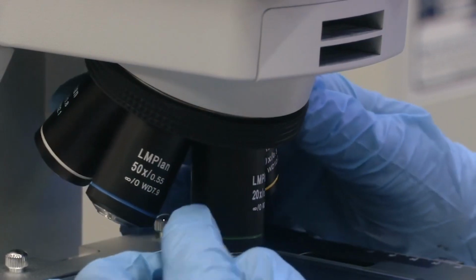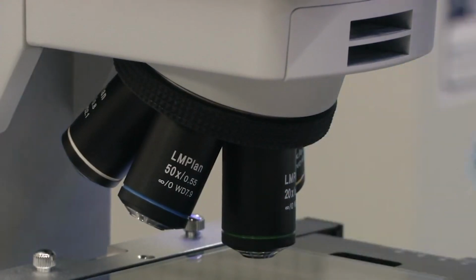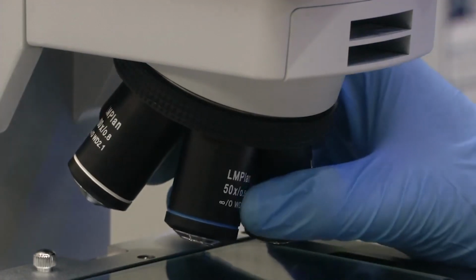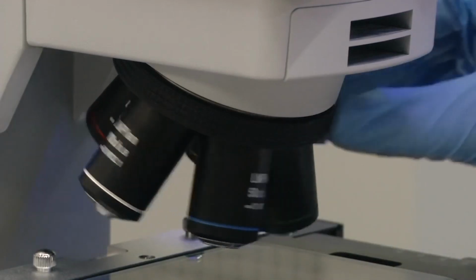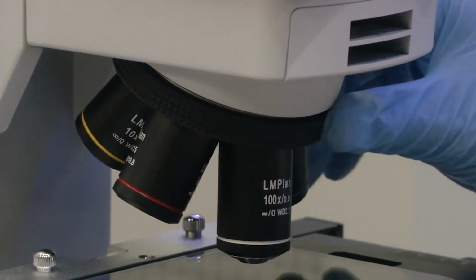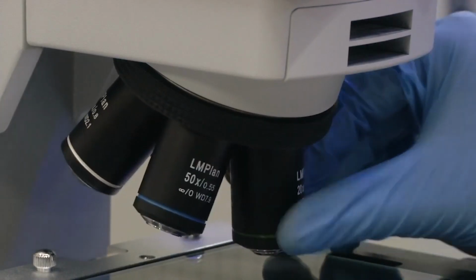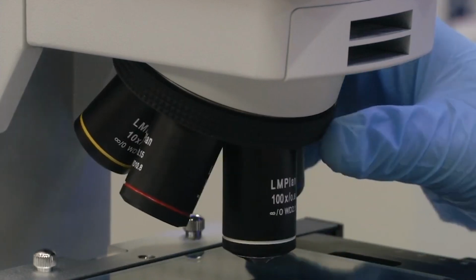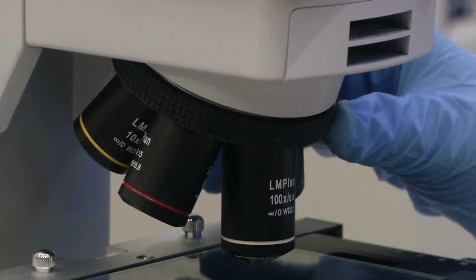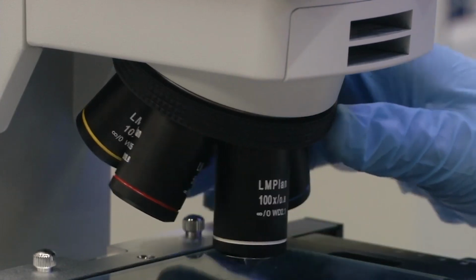Once you put 20x, the 20x into 10x will give 200x effective magnification. Then we have two more, which is 50x here, the blue one, and 100x, which is 0.8. If you see, the working distance for each of these lenses is coming down. This is because with 100x magnification, you have to be very close to your sample to use that lens. So the working distance will automatically come down. That is why here WD is 2.1 and the magnification provided is 100x.